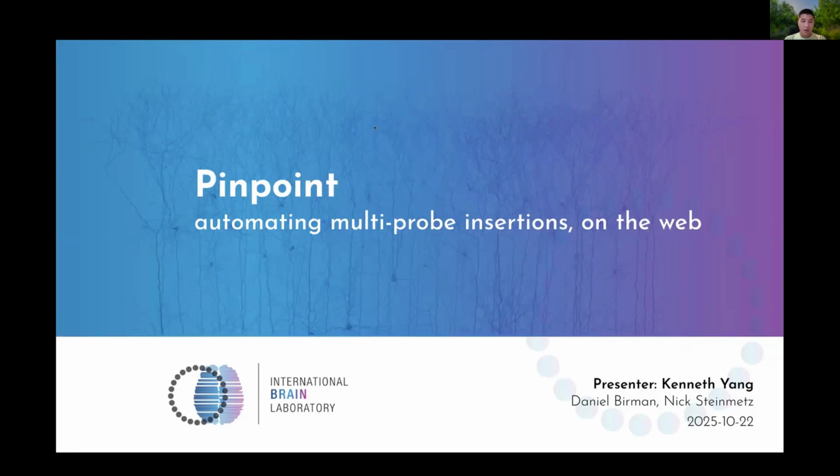So the goal for this talk, I'm hoping to share Pinpoint with some of you who haven't seen Pinpoint before, and then for people who have been using Pinpoint in their labs, I'm hoping to maybe show some new features that we have going on.